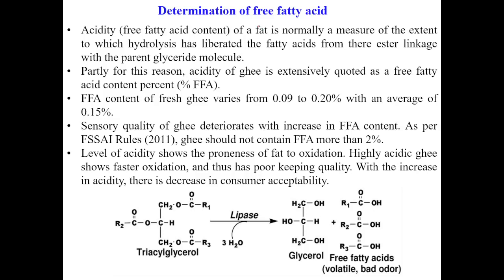Welcome. In this video we will learn about the procedure, reactions involved, calculations and principle of determining the free fatty acid value of ghee. Now acidity or free fatty acid content of a fat is normally a measure of the extent to which hydrolysis has liberated the fatty acids from their ester linkage with the parent triglyceride molecule.